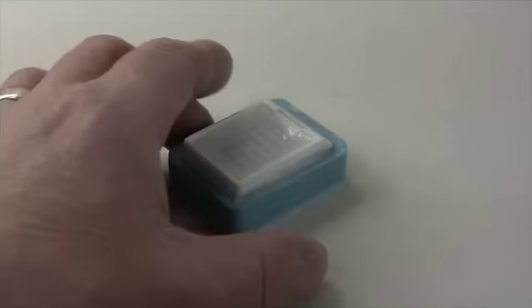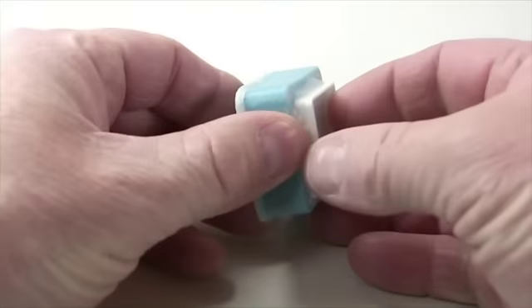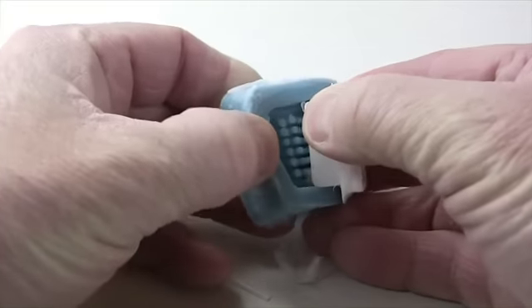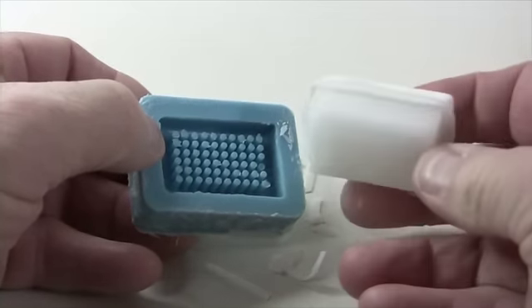Before I pull the array mold and paraffin block apart, I like to wait until they are both at about room temperature. Reason being is that the array mold will be softer and more flexible, and the cores will last longer if you do this.